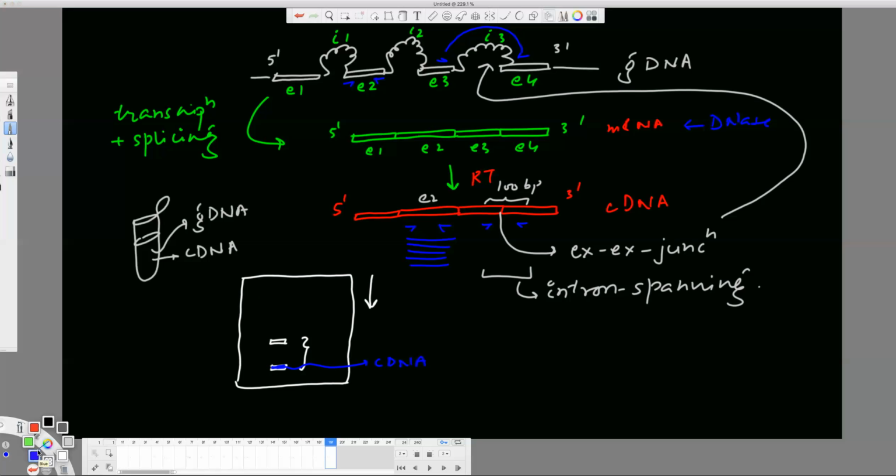But you get to know that it's fine, but I have contamination of gDNA. Now, one of the ways is you can actually isolate this band from this gel and do your further experiment. That's one thing, but these are not recommended ways to get rid of gDNA, right?